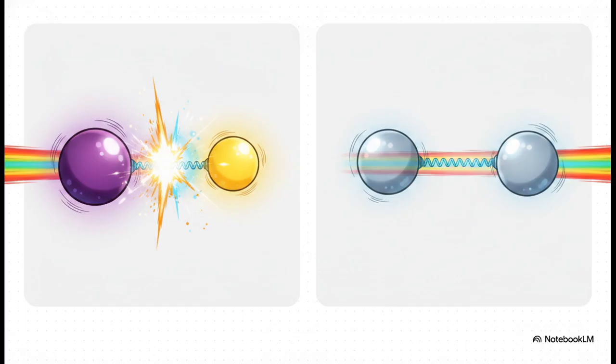the infrared light. But what about a perfectly symmetrical homonuclear molecule, like oxygen or nitrogen? The atoms are identical, so they pull in electrons equally. No matter how much that bond stretches or compresses, the net dipole moment stays at absolute zero. Because of that, it is completely infrared inactive. It's totally invisible to an IR spectrometer.